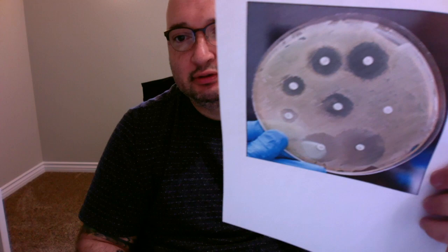Throughout my experiment, and you can see in my experiment video, there was nothing that I did to contaminate substances or improperly place things. Obviously, we do have some microbial growth, and I did spread the microbe evenly around the agar. So I'm very much at a loss why I got this instead of this.